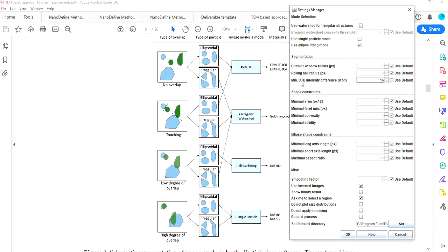You can lower it when there's a really good contrast, and if the contrast is not so good, then you have to increase this difference so you don't see the noise as much. All of this, I haven't actually seemed to need.